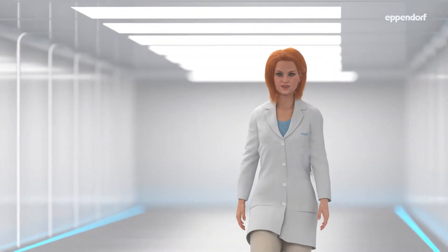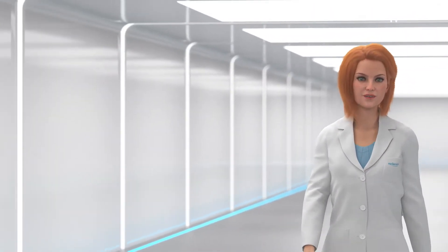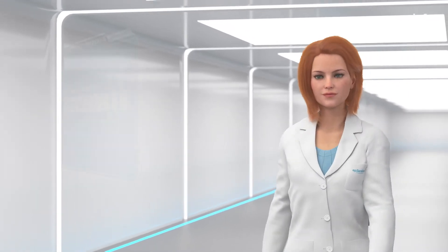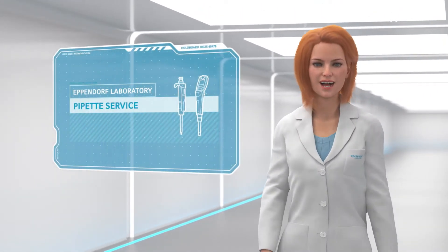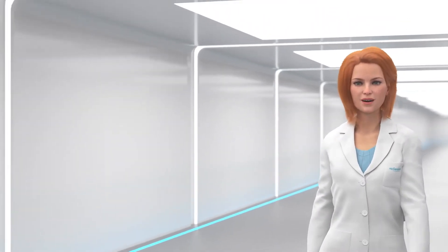Hello, my name is Sarah. Nice to meet you. Welcome to your personal guided tour through our service workshop. Come along with me. Today you will gain deep insight into the various maintenance steps for your Eppendorf pipette.